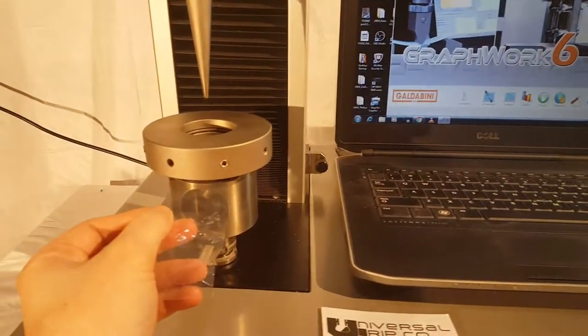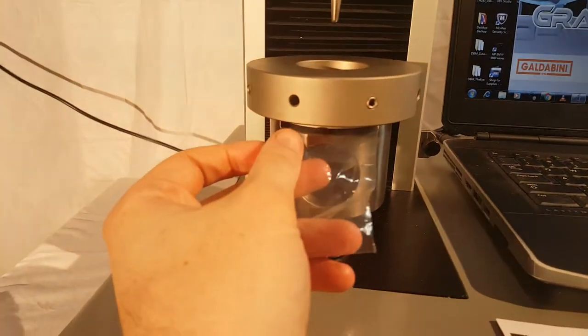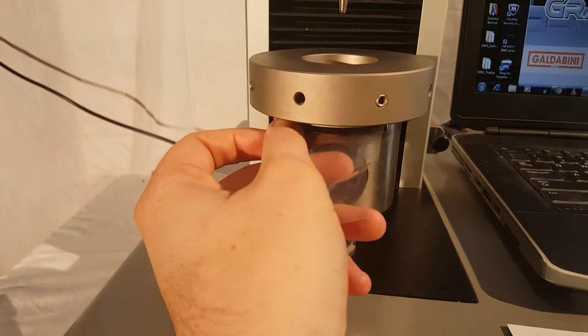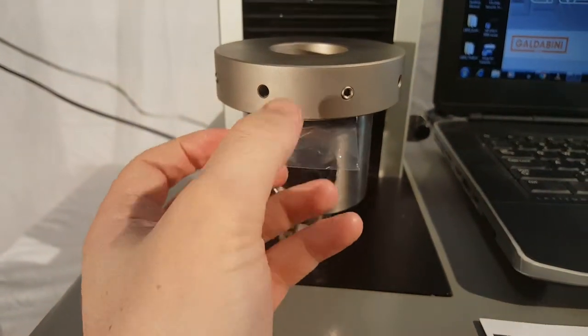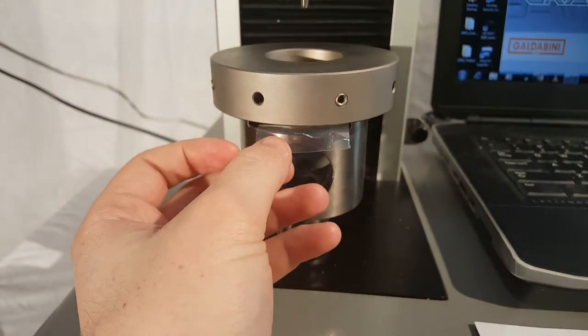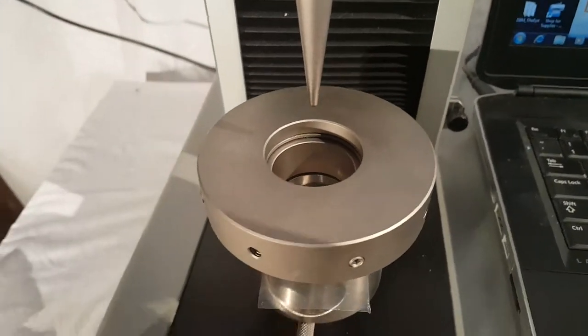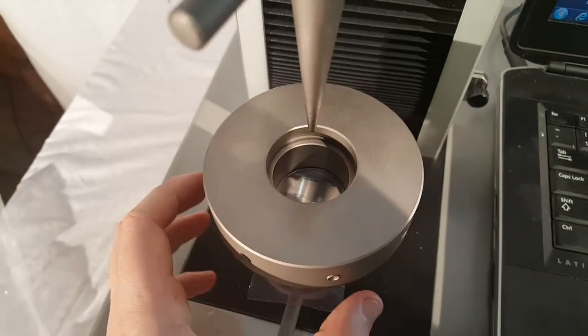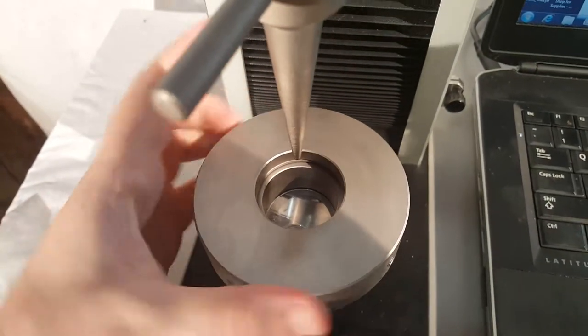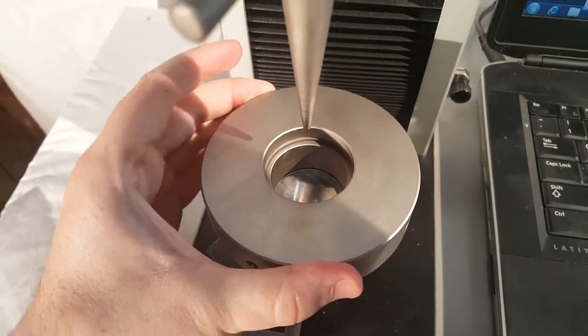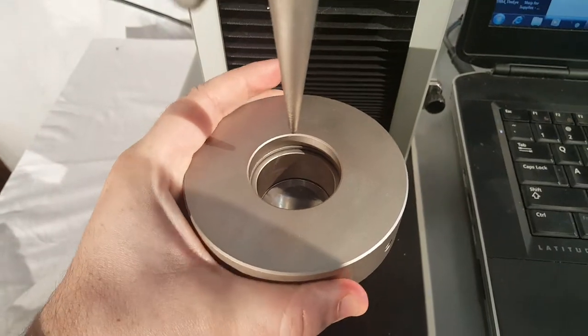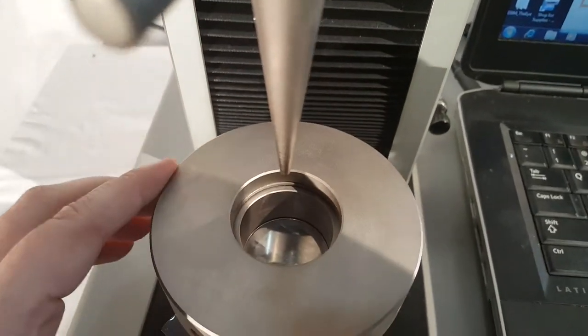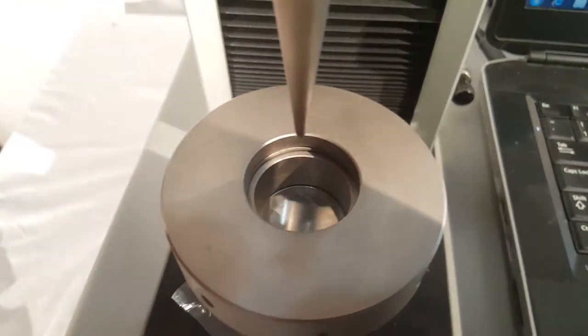We'll go ahead and load a sample into the fixture. First, we push it through this slot, and then we rotate this down to tighten the sample. You can see the plastic in there.